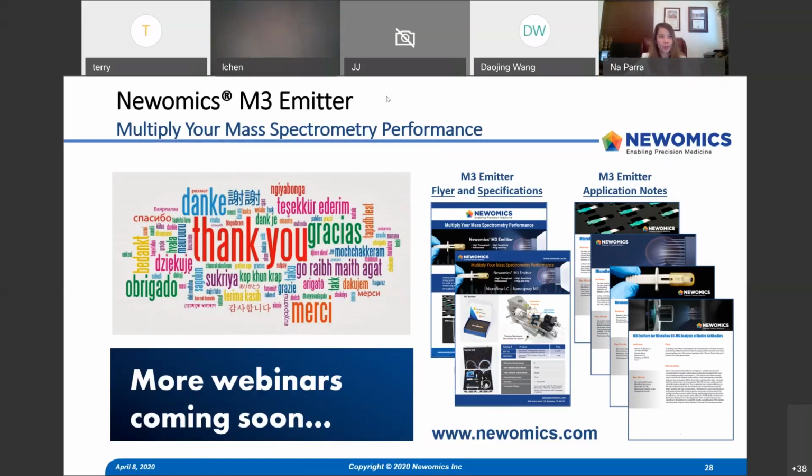The first question we received is, does the M3 emitter work for SciEx MS instruments? Dao-Jing, you're the best one to speak for this. Good question. We have been trying to interface our emitters with SciEx instruments. We collaborated with our customers, Amgen as well as Catalent. We have a prototype interface, and we already talked to SciEx scientists.